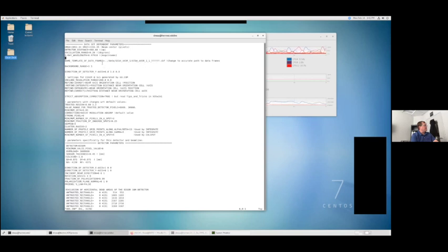So in this case, I'm backing up a directory, then going into data, and then the name of the data set, and then the file name. And here, the file name is given with wildcards of a question mark to represent the number portion of the frame number for the data frames.